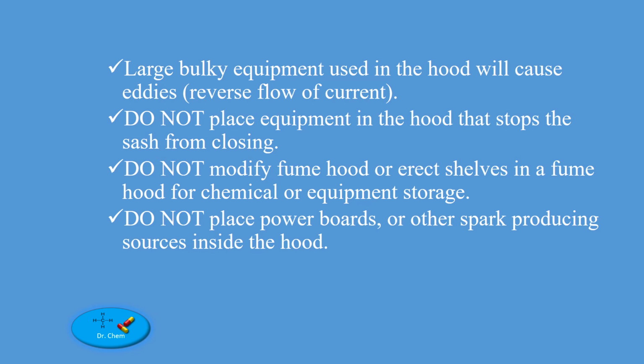Large bulk equipment used in the hood will cause reverse flow of current. Do not place equipment in the hood that stops the sash from closing. Do not modify a fume hood or erect shelves in a fume hood for chemical or equipment storage. Do not place power boards or other spark-producing sources inside the hood.